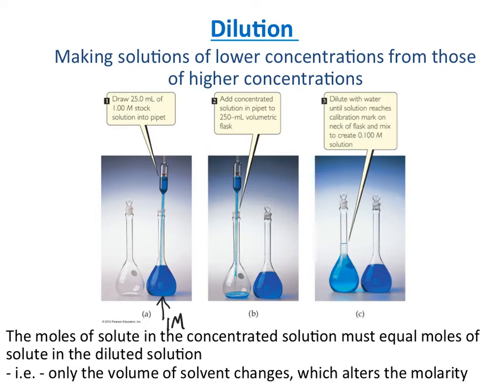We are now going to take 25 milliliters out of that and put it into a new flask. So as we take those 25 mils out, we put it into this new volumetric flask. And then we're just going to fill up this volumetric flask with water up to the line. And so that's what we do, and we've now made a diluted solution.